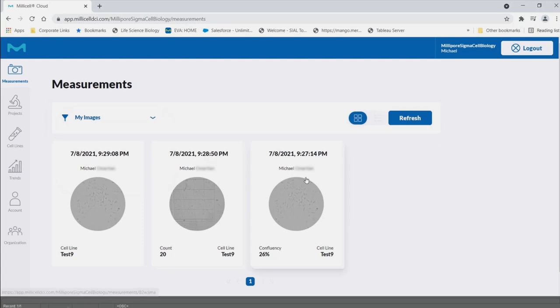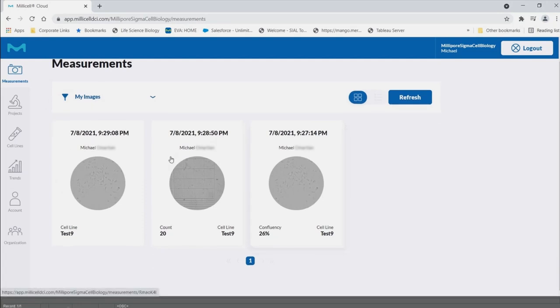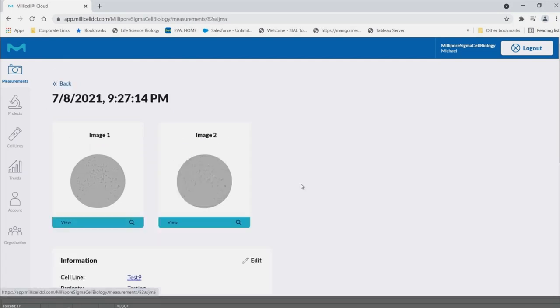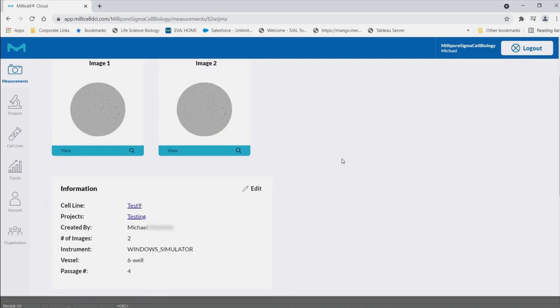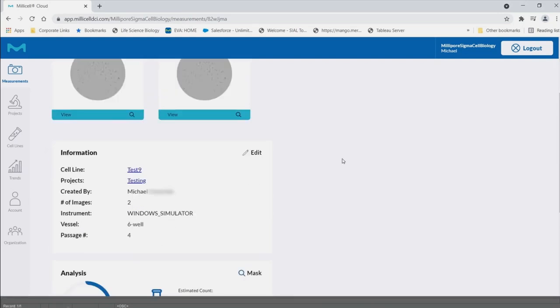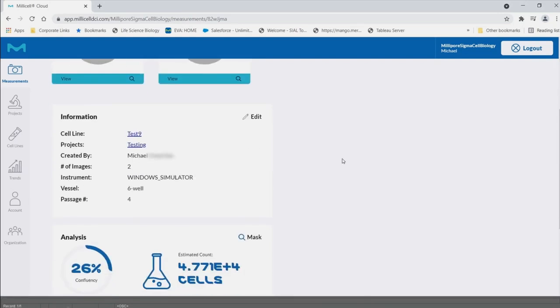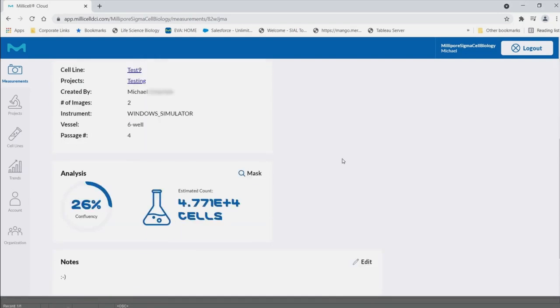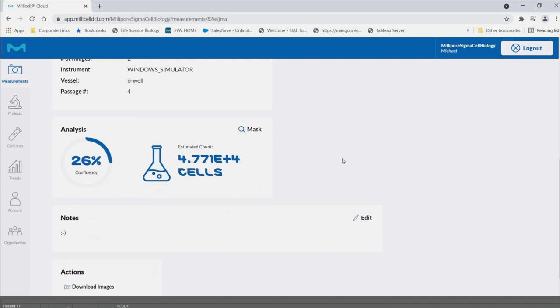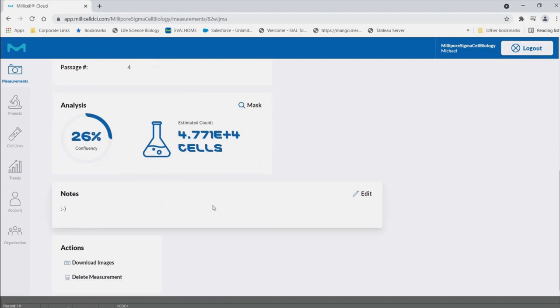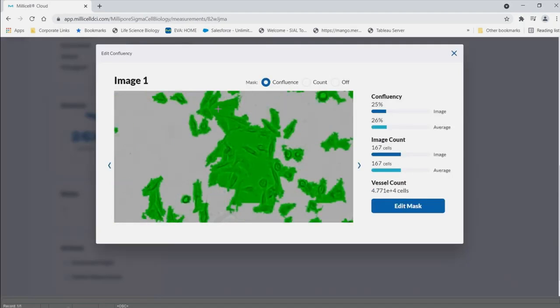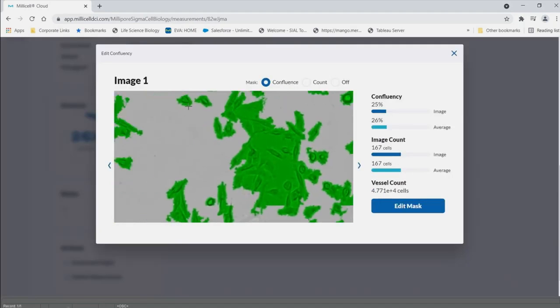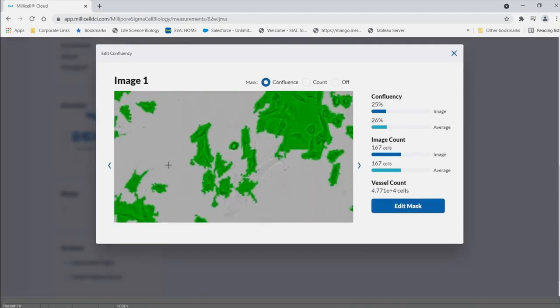Measurements tab. All images will be displayed chronologically. Clicking on the image will bring you to a review screen where all the information and analysis details. Here you can include notes and download the images and data. You can also edit the information and or analysis by clicking edit.